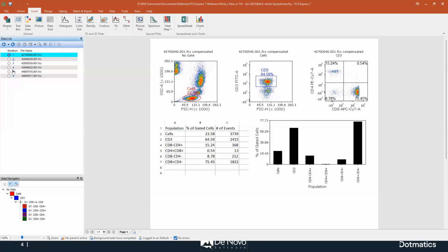Usability studies clearly show us that there are some new users that find the blue number here not very clear in terms of clickability. So what we've done was adding a radial button, and now you can click anywhere you want, either on the radial button or on the blue number.